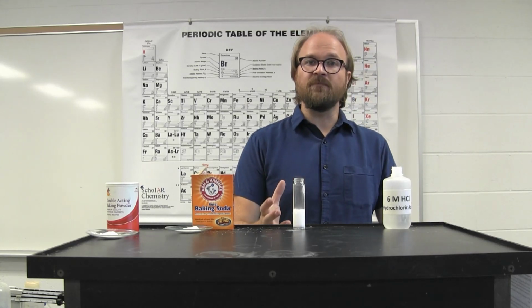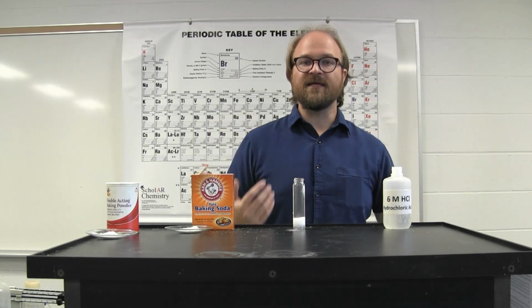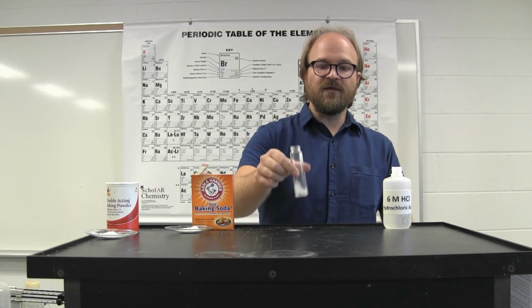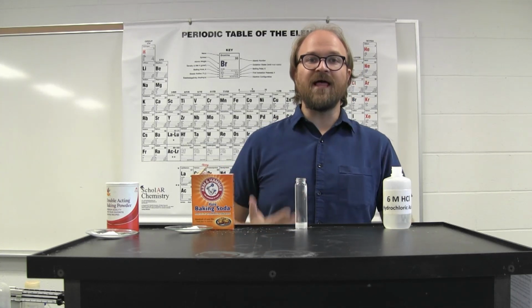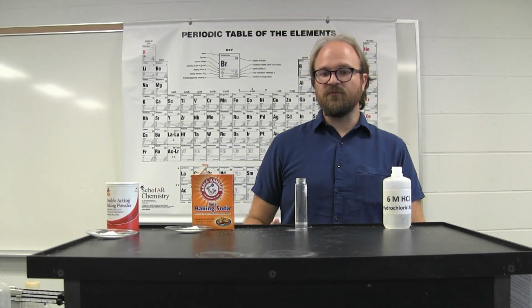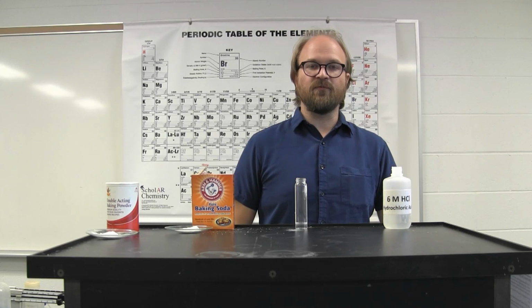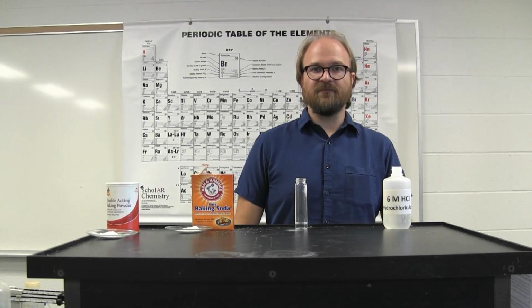After the reaction is complete, the carbon dioxide was released as a gas, and therefore the total mass present is now less than what was started with. The difference between before and after the reaction is the mass of carbon dioxide.